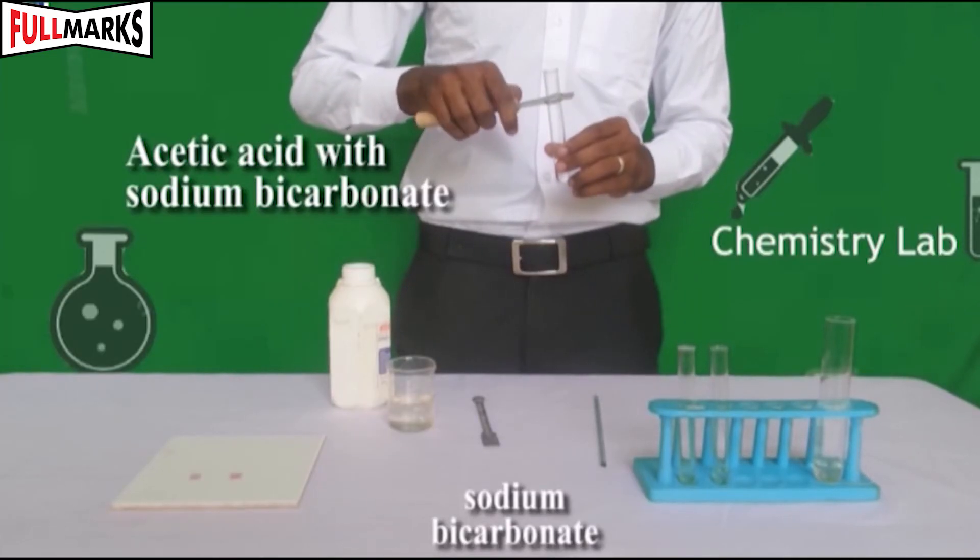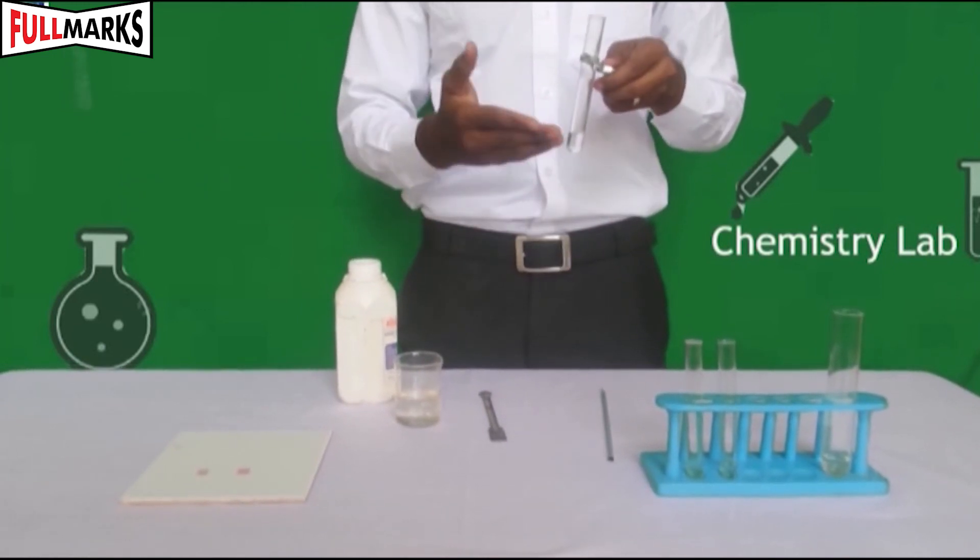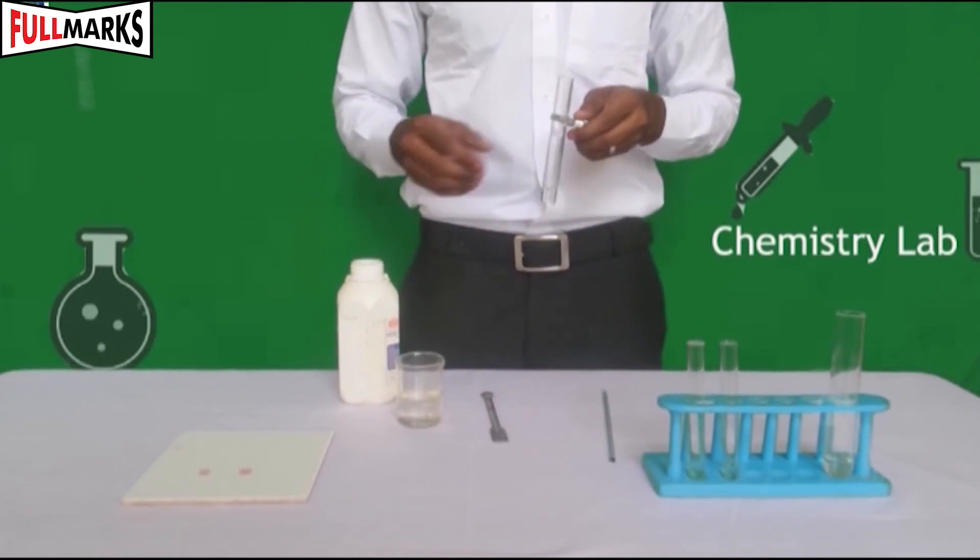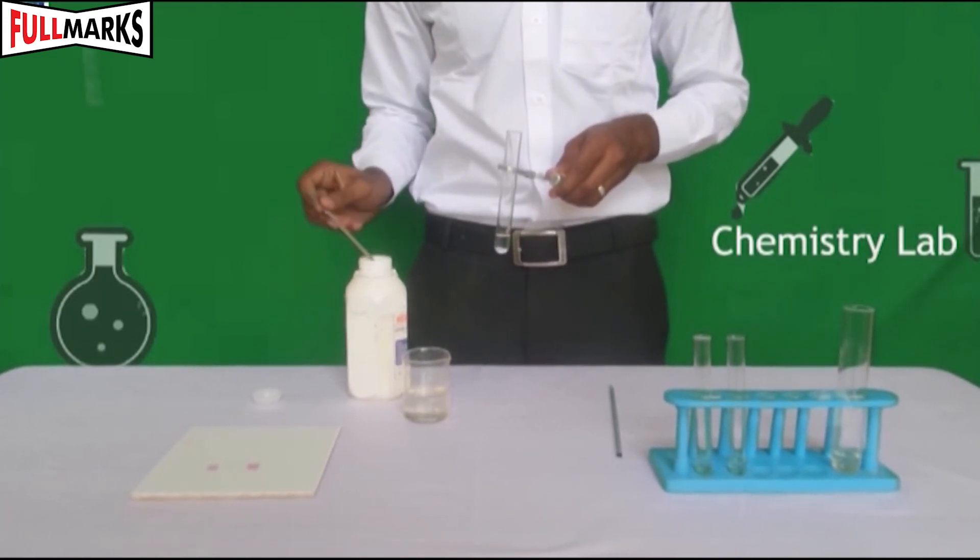Test 4: Acetic acid with sodium bicarbonate. Take a pinch of sodium bicarbonate in a clean test tube, add 1 ml of dilute acetic acid in the test tube.